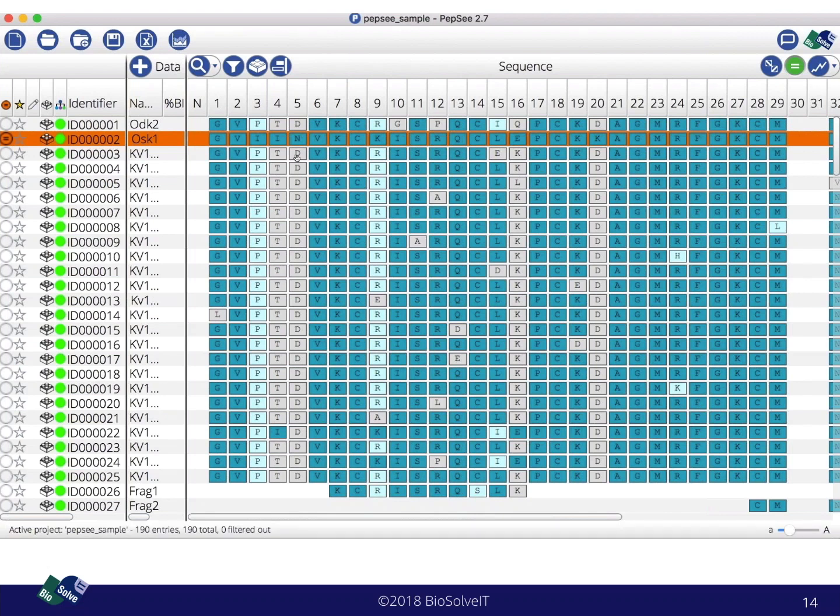So with this, you have a very speedy instrument at hand to rapidly obtain sequences from the literature, if they are not in graphical format, of course, because then we can't currently pull that out from PDF files. Quickly align them and relatively quickly also see what was worked on these sequences before.